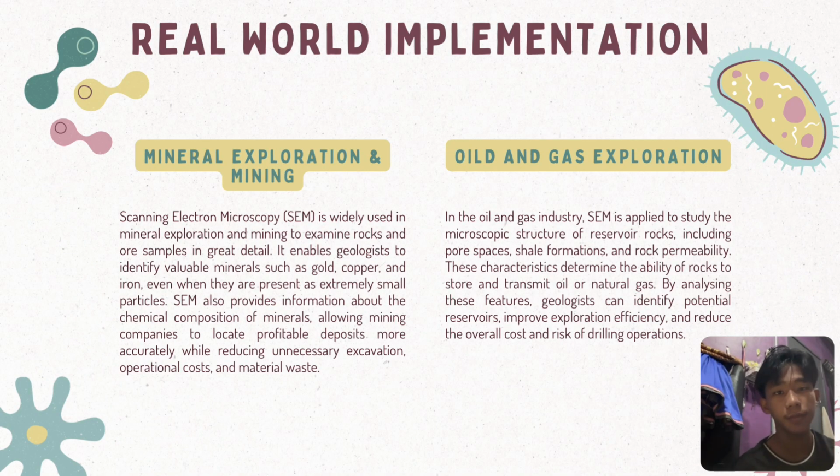We see this put to work across major industries. In mineral exploration and mining, SEM allows geologists to examine rock samples in great detail to identify valuable minerals like gold or copper, which minimizes excavation waste.